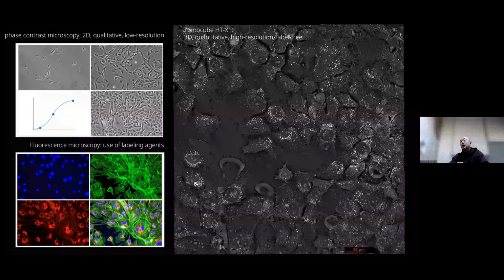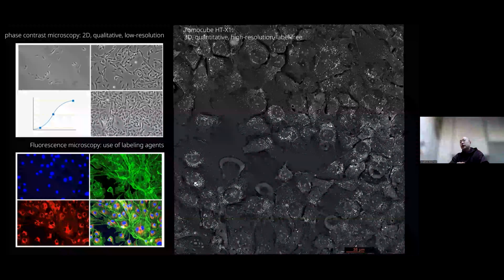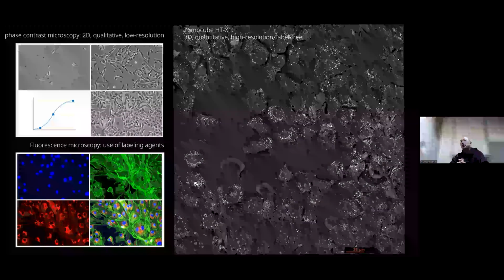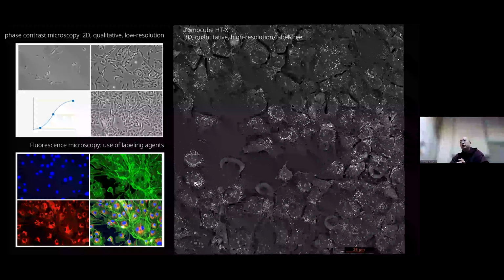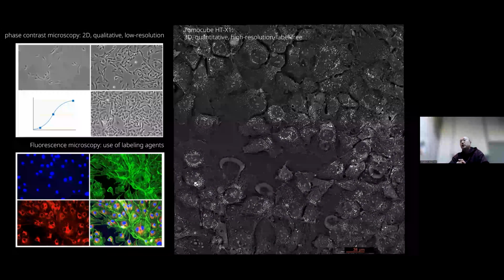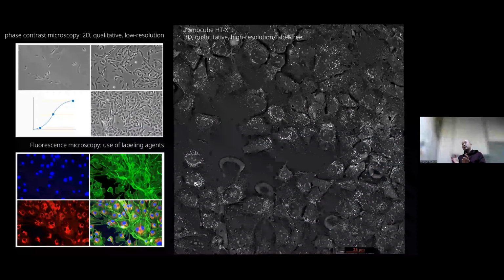But we realize the majority of cell biologists are not familiar with this kind of advanced analysis, and they are not even familiar with open source. Some of the users have trouble in fully using ImageJ and other software. So that's why we are trying to make a simple analysis software so that they can save their time.